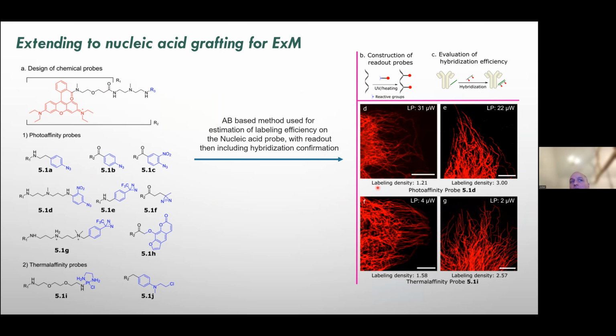the labeling. And then what you see from this is that you can get to very high labeling densities here, while still maintaining very efficient docking to the target probe. And you can get very clear signal. So in all, these are reagents that can be used for the very simple creation of labeled DNA, labeled RNA. They do work best on single-stranded systems. That's just their chemical nature.